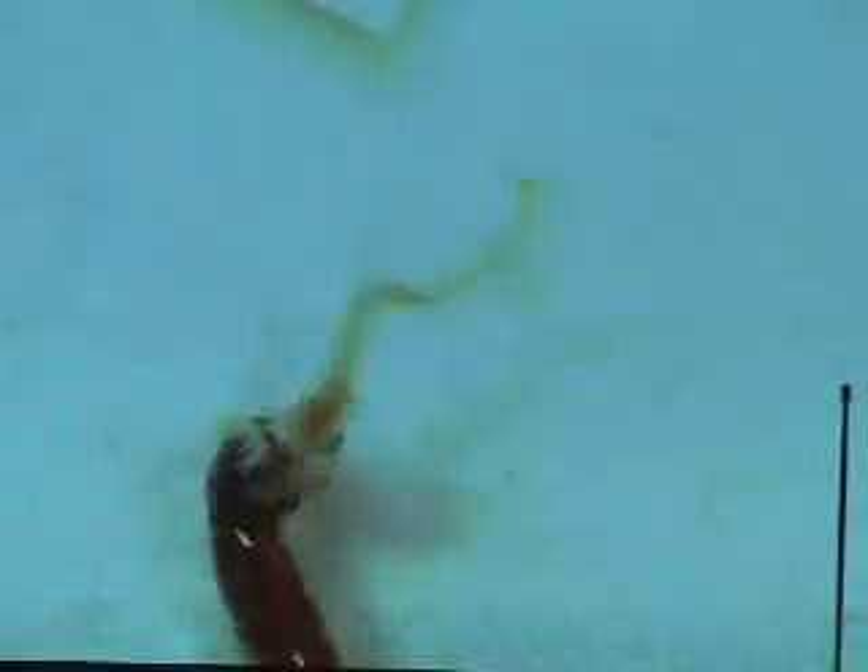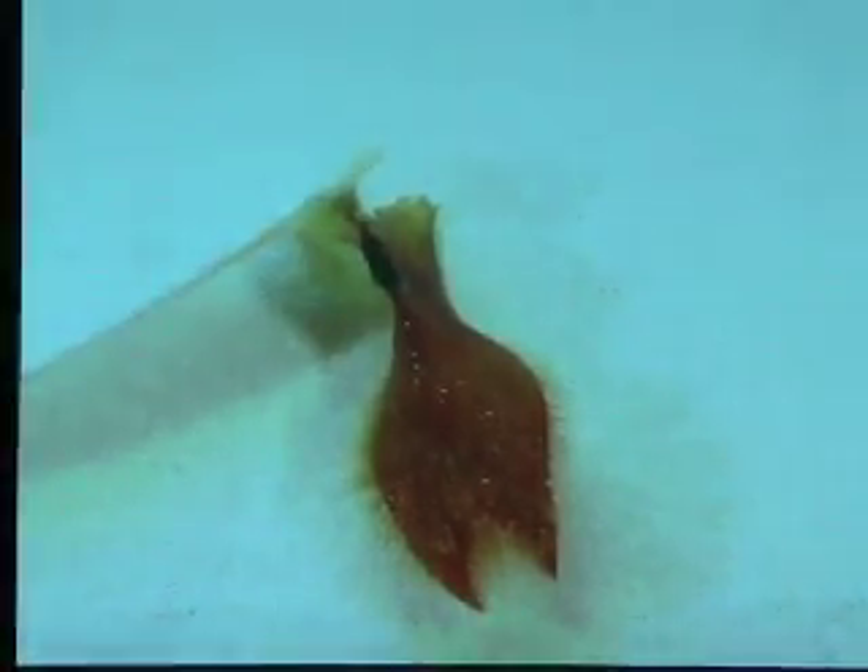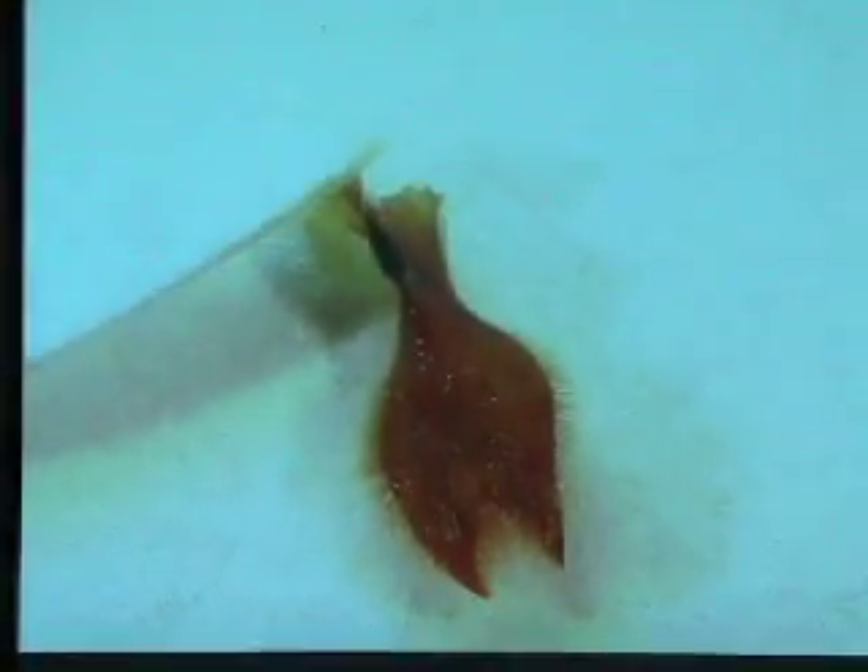Now I'm going to go back to being left-handed. This is the aedeagus, and I don't want to get much glue on this, so I'm just going to glue it at the base. We come over to our little platform of glue. Here's the hypopygium — the posterior part is really important; I just want to get the point somewhere on the base there so it'll hold. So now I've got these three main parts of the genitalia glued, such that when we put the pin through the point, they will be in the same orientation as in the actual male. Everything's pointing in the same direction as it would be inside the male, which helps keep track of directions.